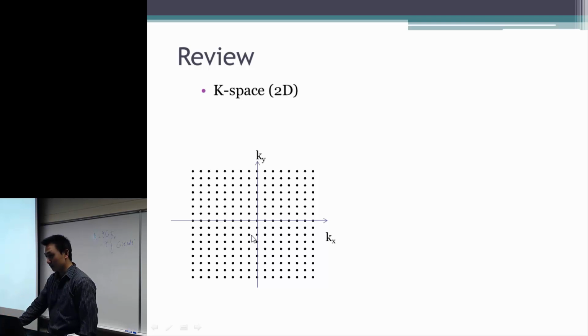In principle, as long as we collect all of these points, we can give you an image, no matter in what way we collect. So if we have the time and the energy, we can do that just by collecting each point using each excitation.